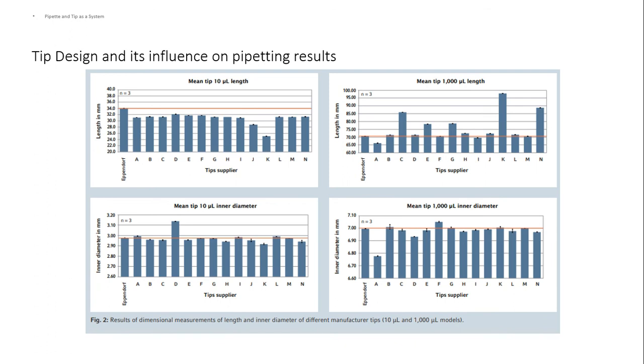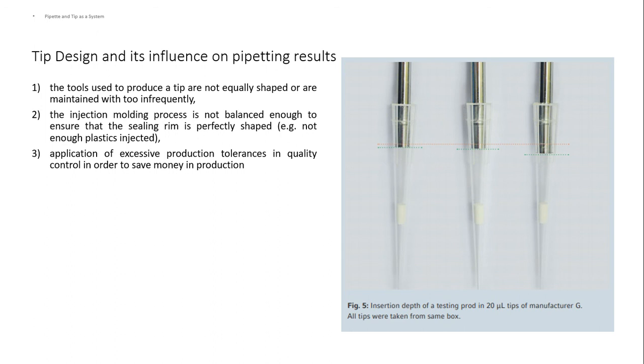This illustration is about the influence of the sealing rim on the creation of an airtight system.